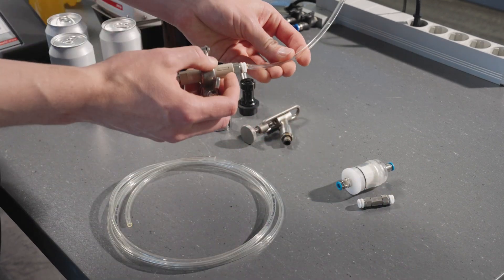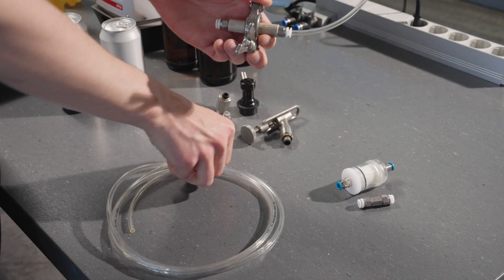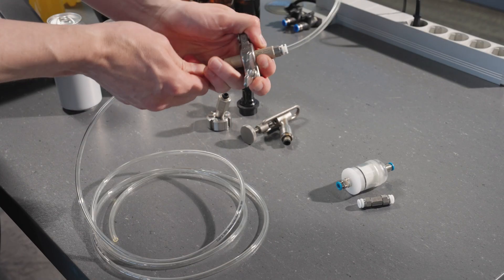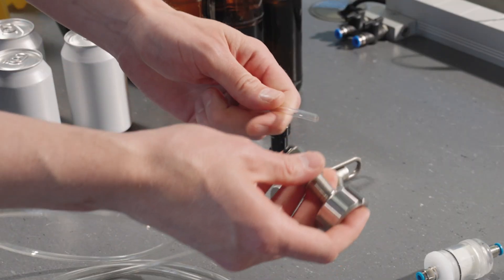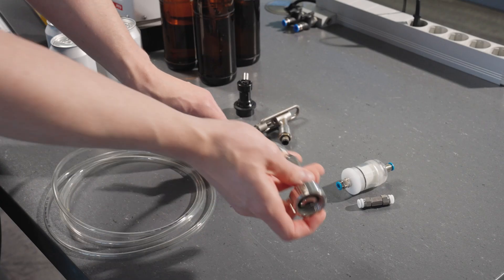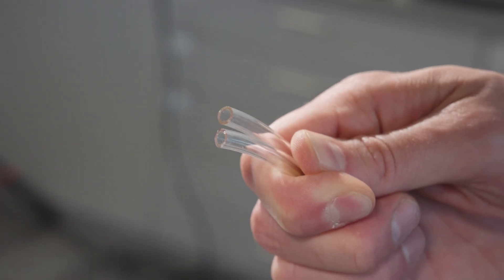Prepare and connect the filter, adapter, and hoses. Ensure all connections are tight. Cut the hoses straight and as short as possible.